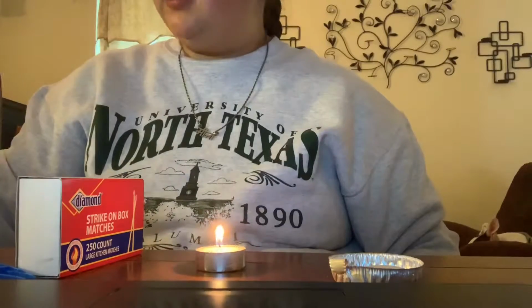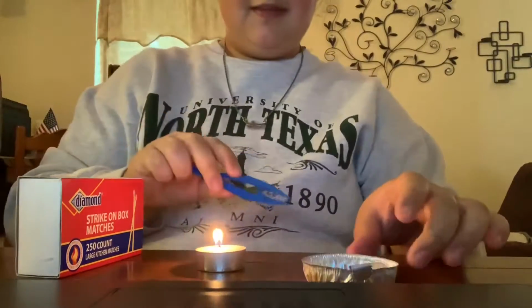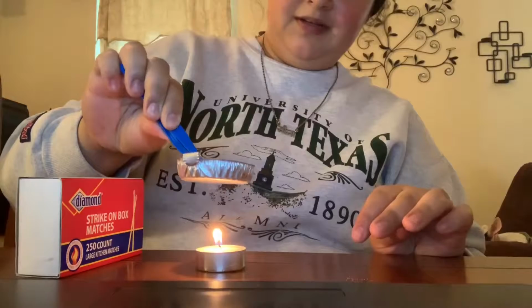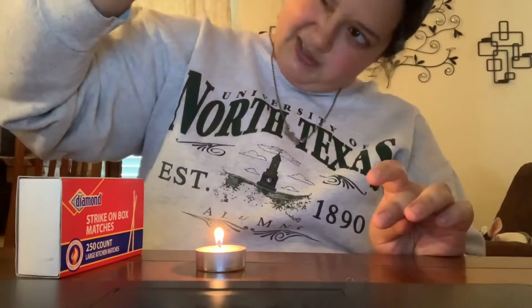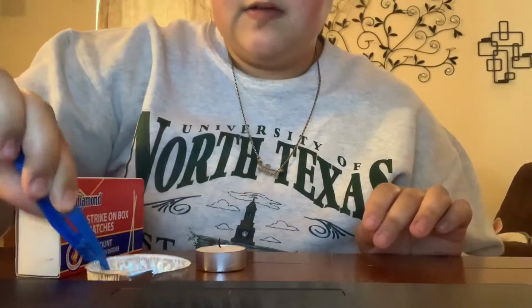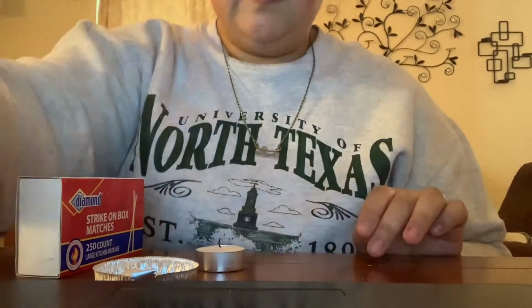Just make sure that the match is properly extinguished. And I have my forceps. And just, oh, what do you know? It's melting. I'll just make sure it's not burned or anything. And now I will be conducting the rest of the required observations for part B of activity 4.